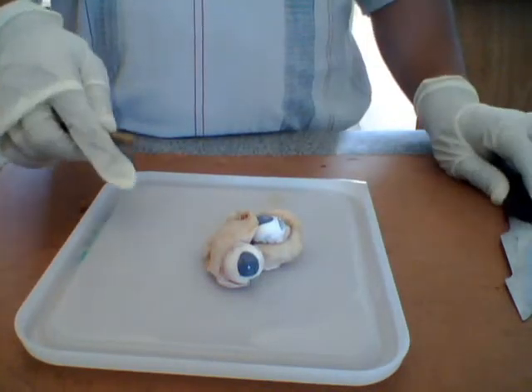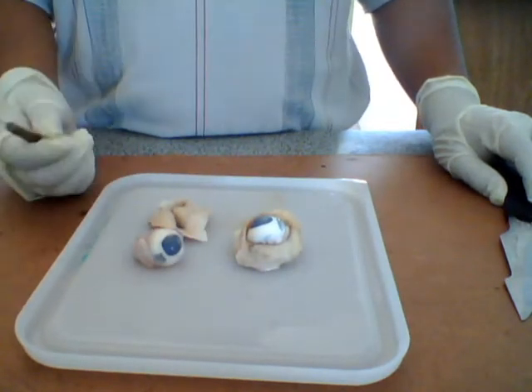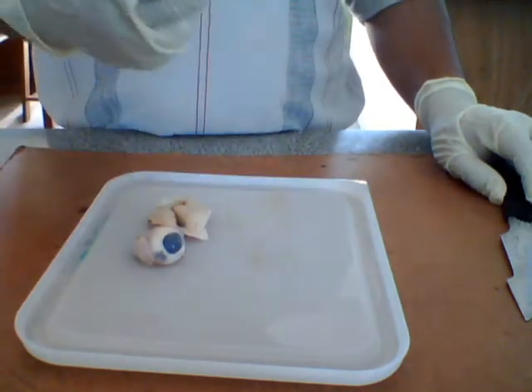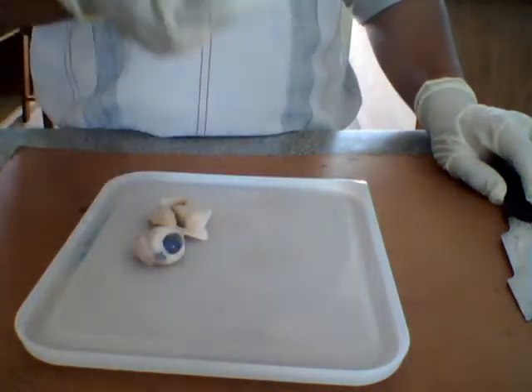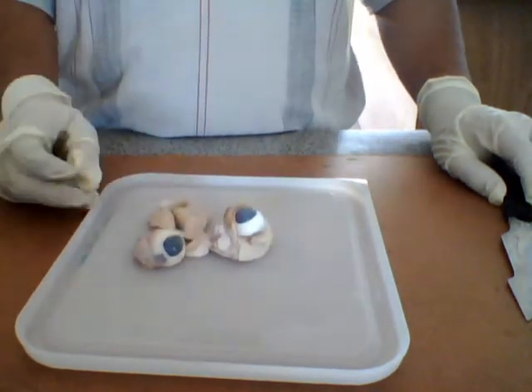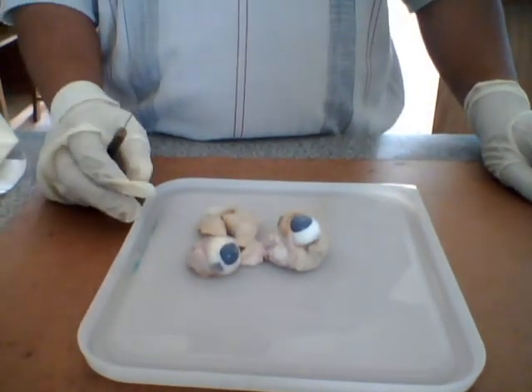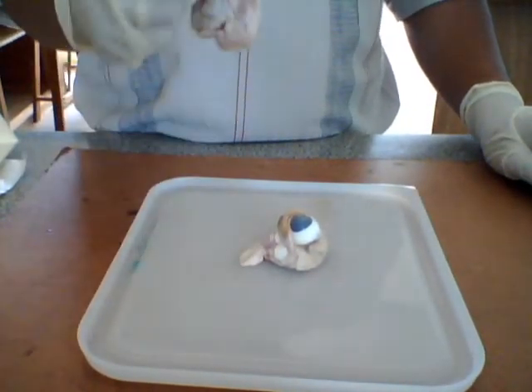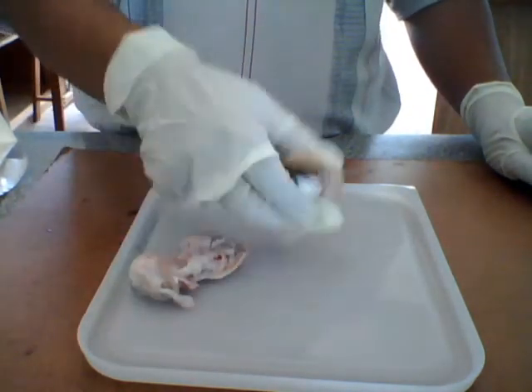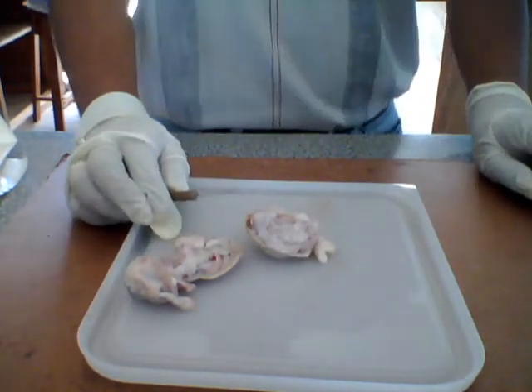Good morning guys. Today we're going to do the dissection of the eye, and we are using the eye of — I believe it's a pork eye. We're going to work with limited resources. The first thing I want to do is identify where is the optic nerve.